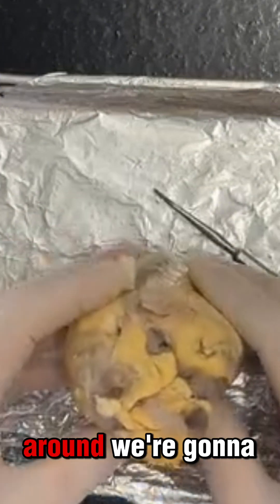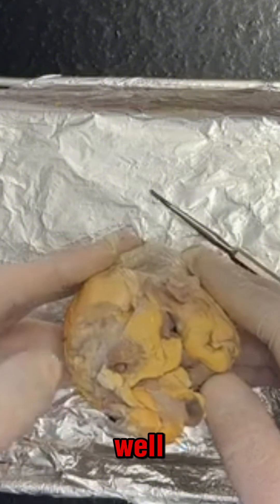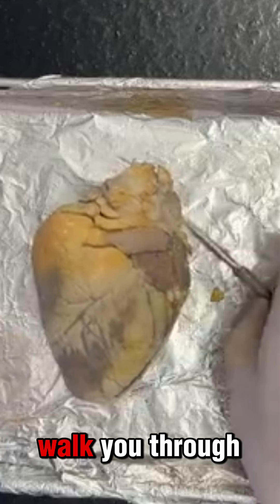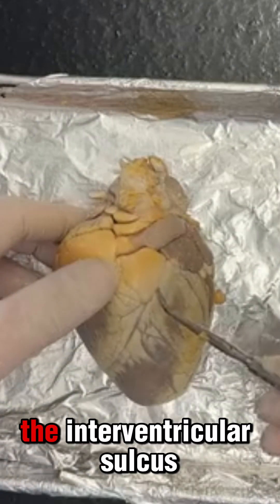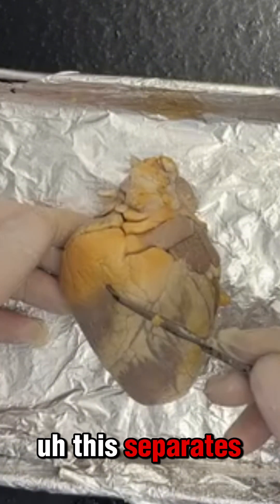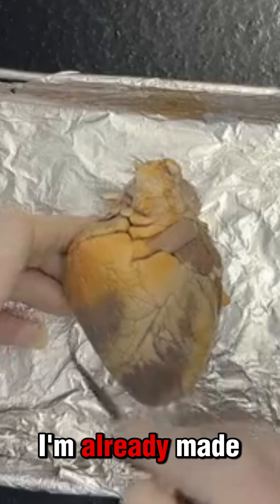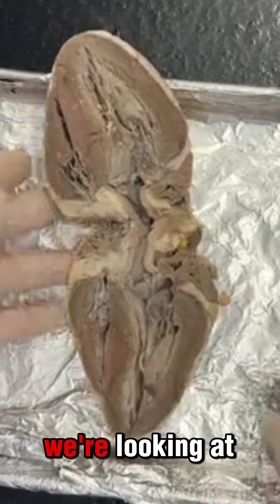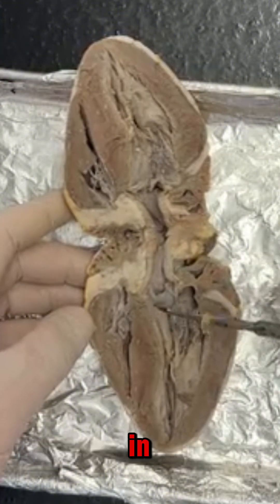When I turn around we're going to see a couple different arteries and a couple different veins that make their way into the heart and make their way out of the heart. Here I have the interventricular sulcus, which separates the right from the left side of the heart. I've already made an incision going all the way around the heart, so when I open this up, this is what we're looking at right now.